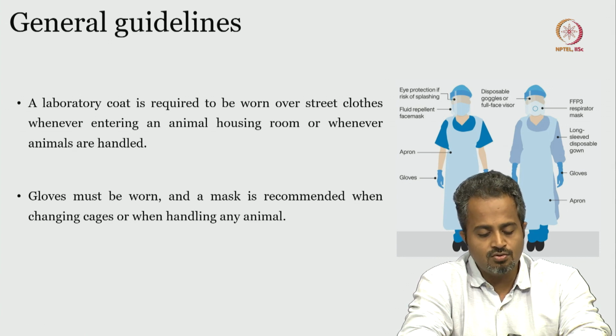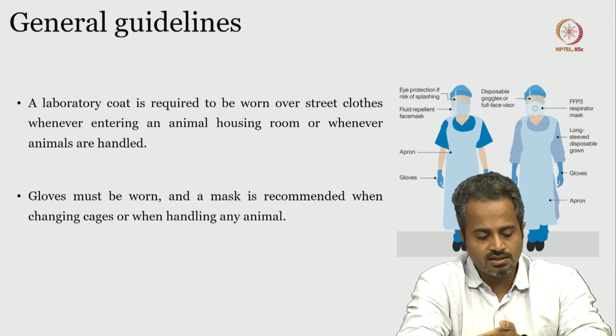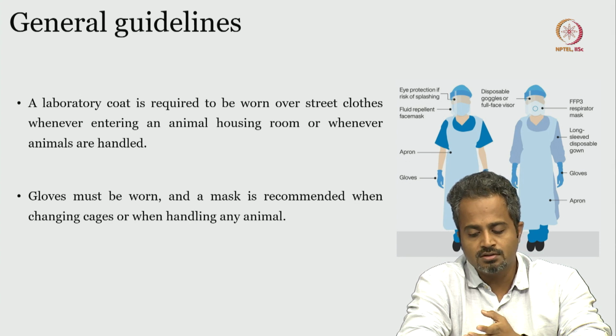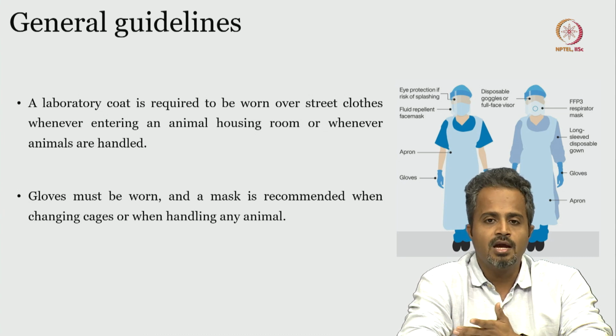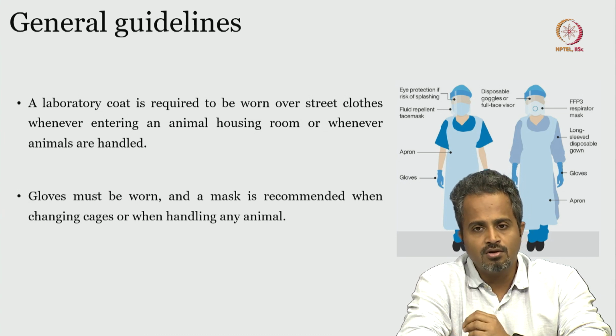Okay, that's another thing. The first and foremost, as you can see here, is the lab coat that needs to be worn over the street clothes when you are entering the animal housing room or whenever you are handling the animal.